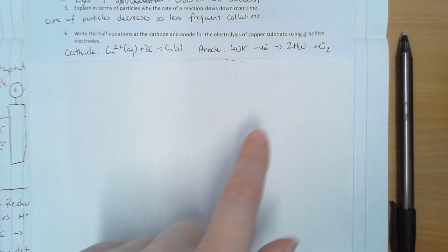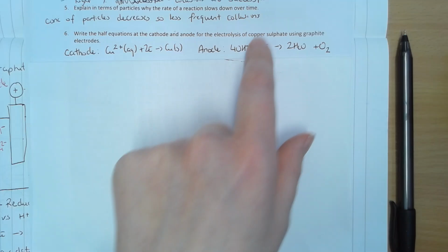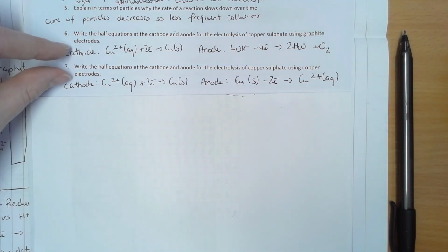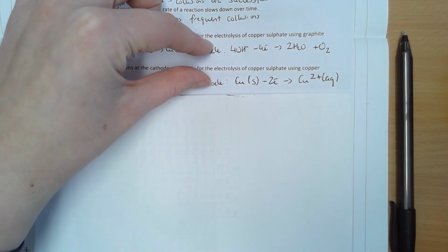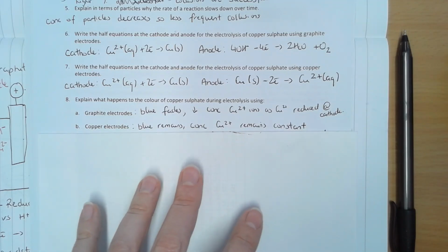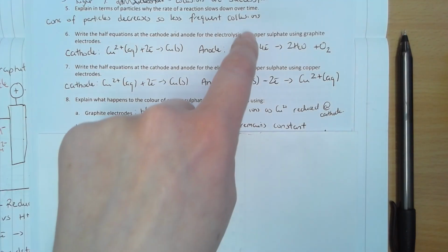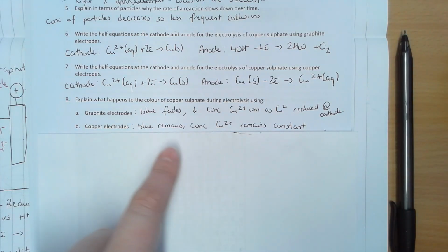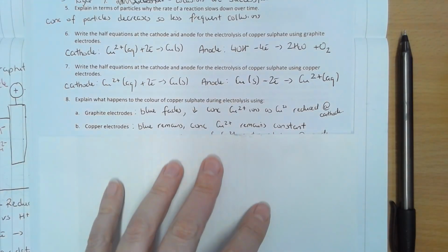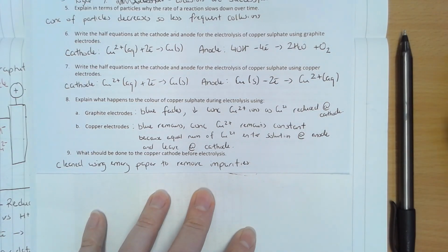Alright, in 6, because I've said graphite electrodes, this is your equation at the anode. You could write it the other way and have the electrons on the other side. But as soon as I switch to copper electrodes, you'll see the cathode equation is still exactly the same, but the anode equation has changed because the copper can get involved. In terms of colour, at the graphite, the blue will fade. We are losing Cu2+, but we're not gaining any Cu2+. But with the copper electrodes, because we lose it but then gain it, the Cu2+ remains constant, and the colour will remain blue.